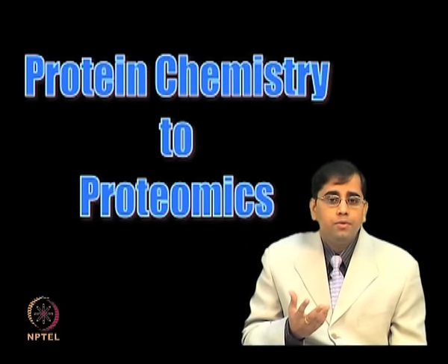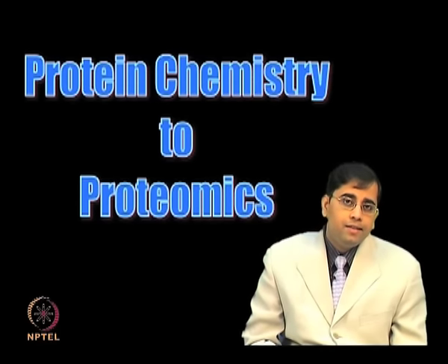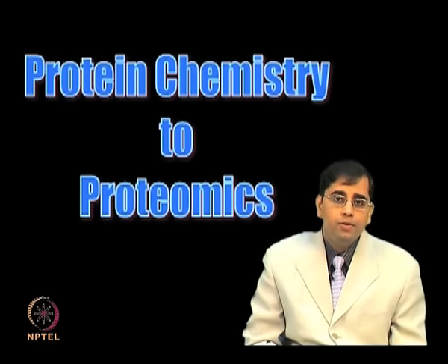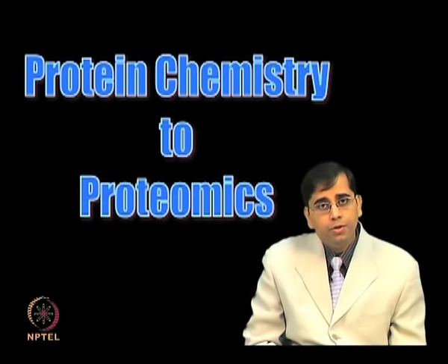So, what is new? The technological advancements in protein analysis, with increased sensitivity, resolution and capability to carry out high throughput studies, have led to the transition from protein chemistry to the new field of proteomics.